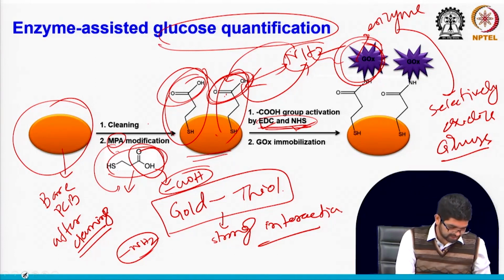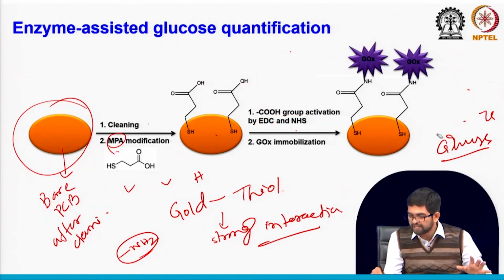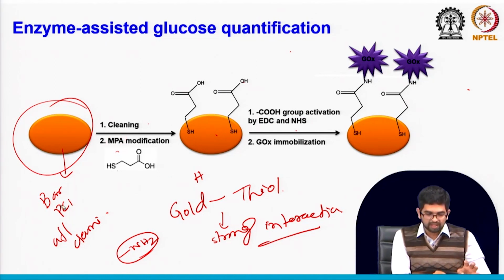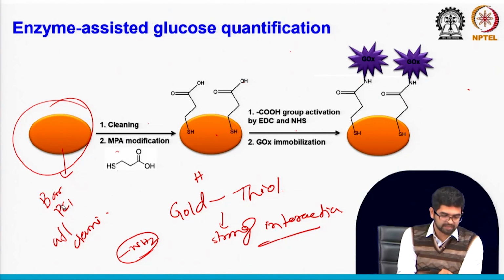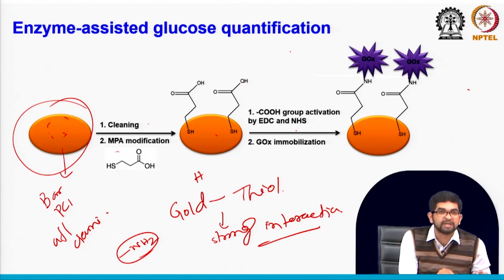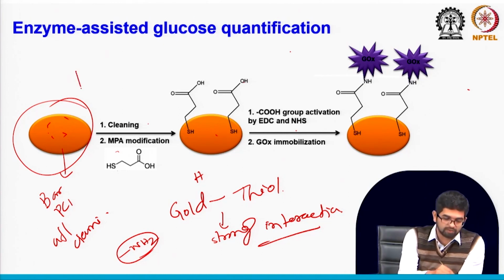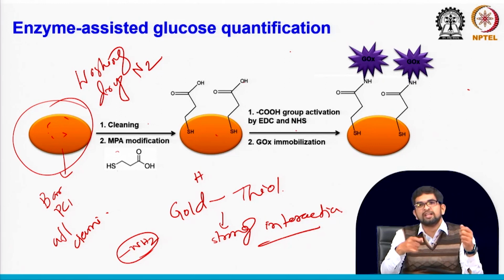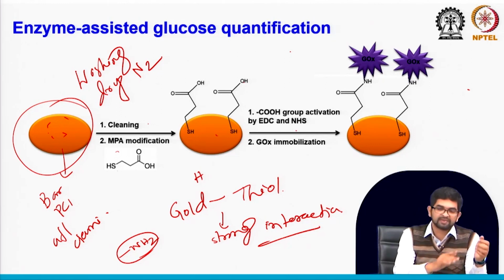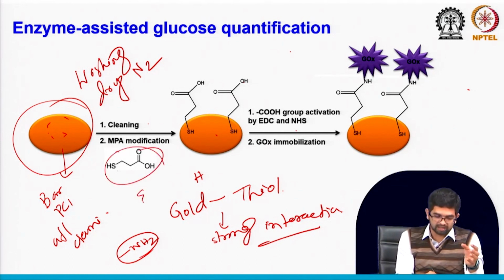But you have to keep in mind, as slowly you become an expert in sensor surface development, you may need to wash the sensor surface many times. So you have to be very careful with the washing of each step. Like after the cleaning, definitely you have to first thoroughly wash your surface. If some contaminant is present, it may impact your sensor reproducibility. So after treatment, be careful with the washing steps. Thoroughly clean and then dry the surface with some nitrogen gas. You can flow the nitrogen, dry it, then use the MPA. Then again after the modification with MPA, which is an organic molecule, you may need ethanol here.